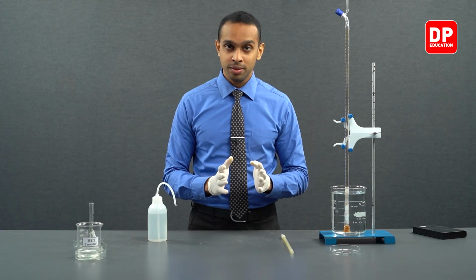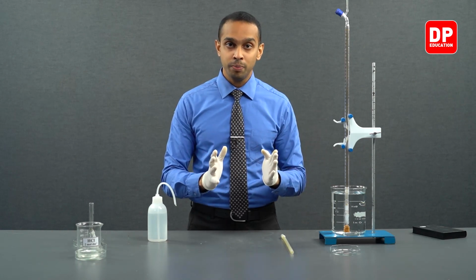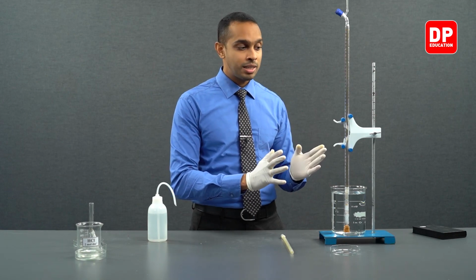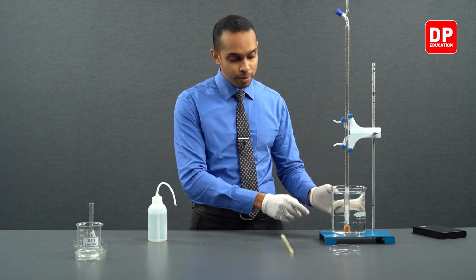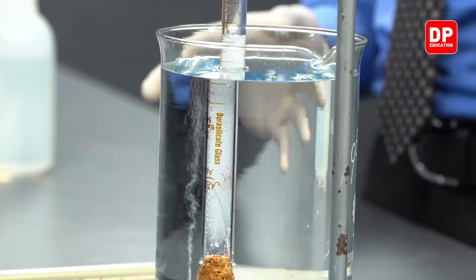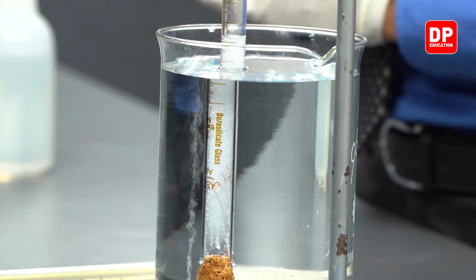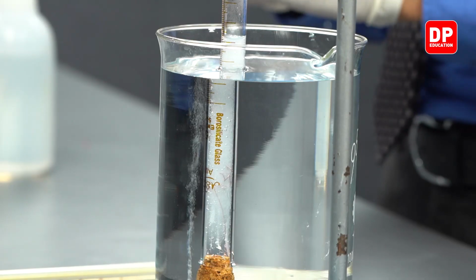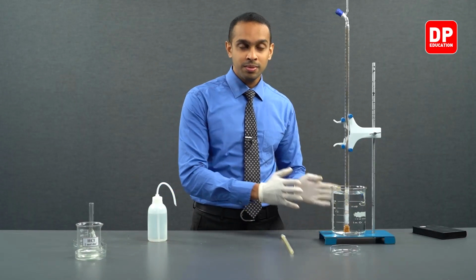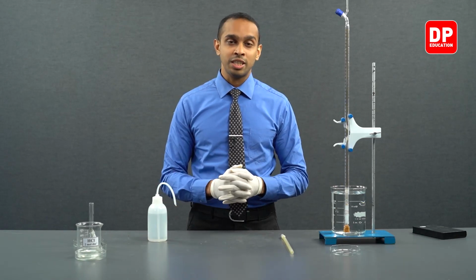At that point, we will allow the system to come to an equilibrium, in the sense we will allow the system to settle so that all the gas is collected, even the tiny bubbles you see here mixed in this area of the burette, they should all get collected in the upper part of our burette. After everything has settled down, we will be taking a look at the temperature of the system as well as the burette reading that we have when the reaction has gone to completion.